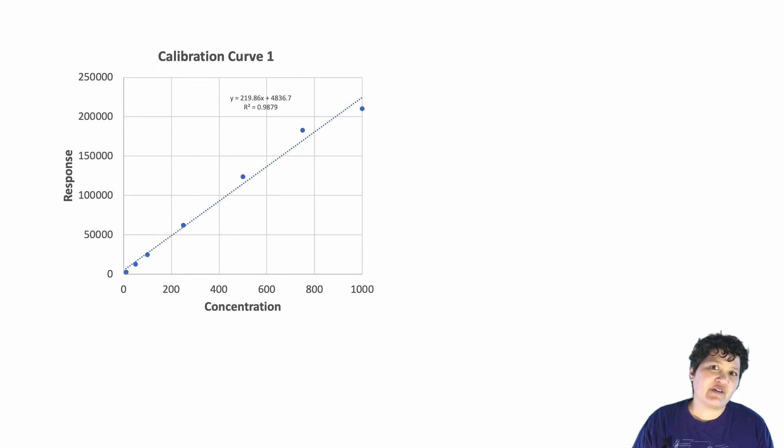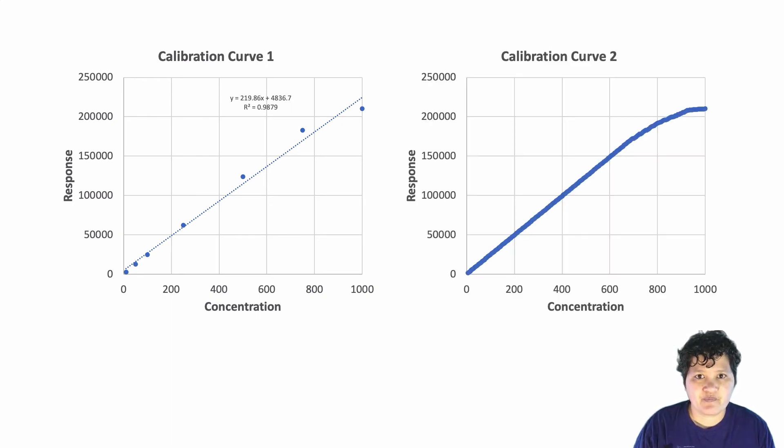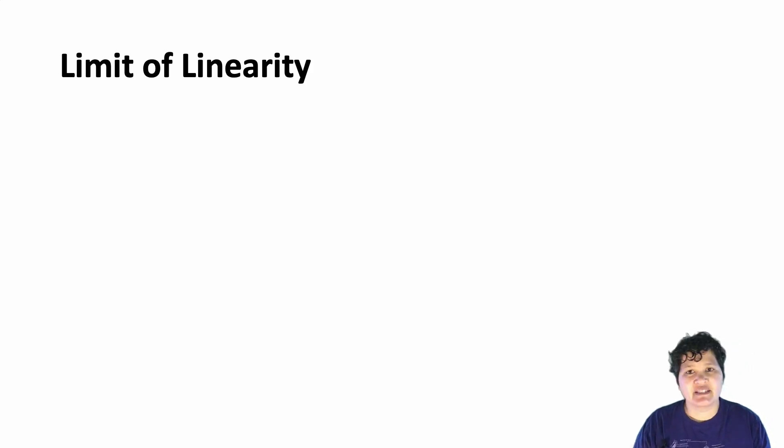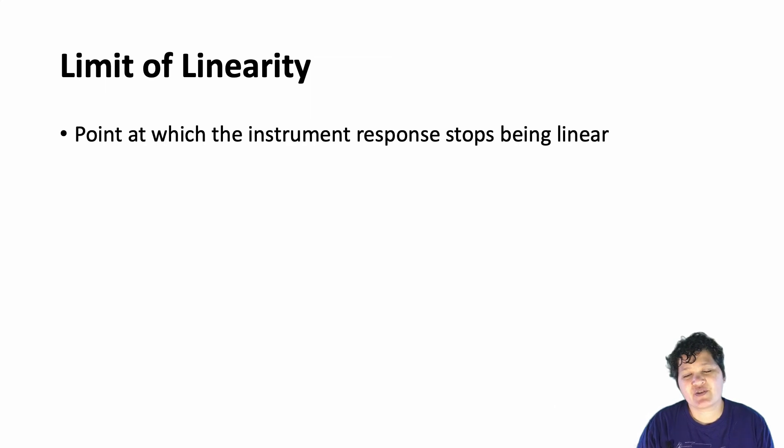So your advisor is very frustrated and tells you to make 100 different standards all at different concentrations. After a very long day in lab, you finally made all the standards, you run them on the instrument and you got this graph. What you have discovered is the limit of linearity for your instrument, which is basically the point at which you stop getting a linear instrument response. The most common reason this happens is that you have maxed out the detector. In other words, your detector cannot register any more electrical signal.